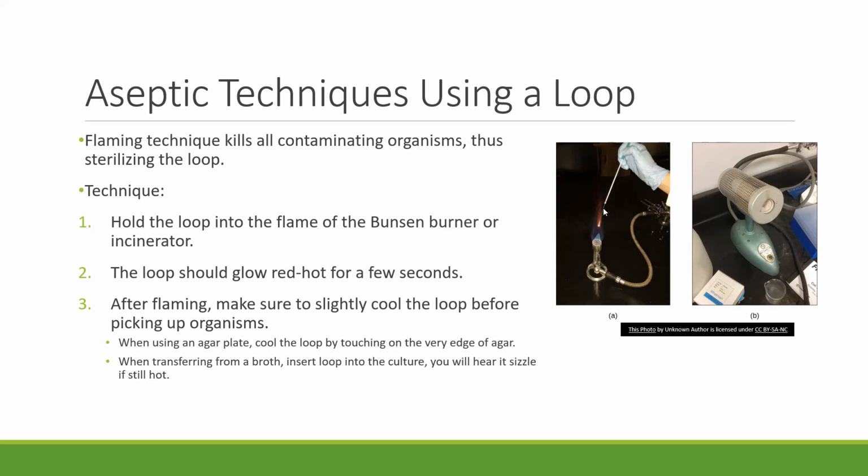And then how do you test that? Well, if this was in a lab, you would touch it up against the agar on the side of the plate if it was a solid plate, or if it was in the test tube, you would barely stick it into that liquid, and if it was sizzling, then you know it was a little too hot. Allow it to cool for just another second or two before you start your process and gather the sample that you need for transfer.